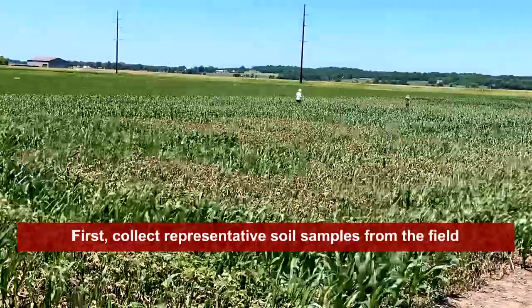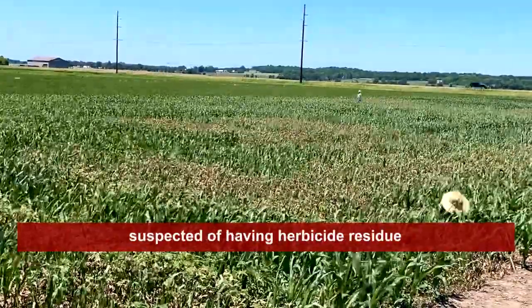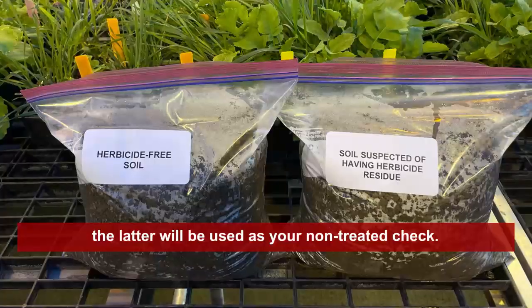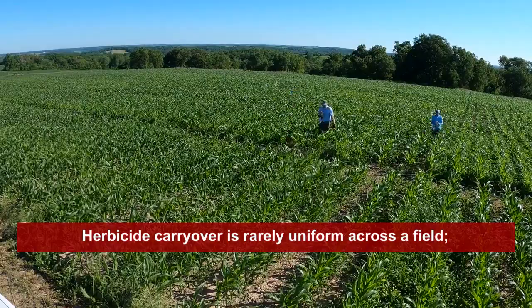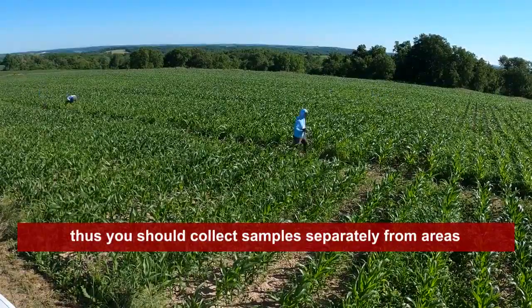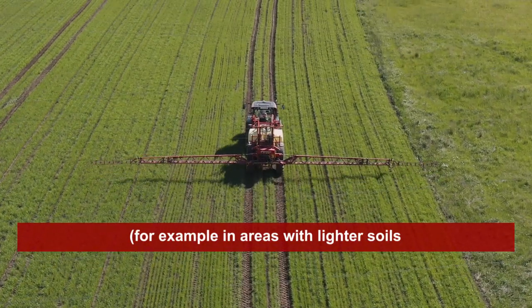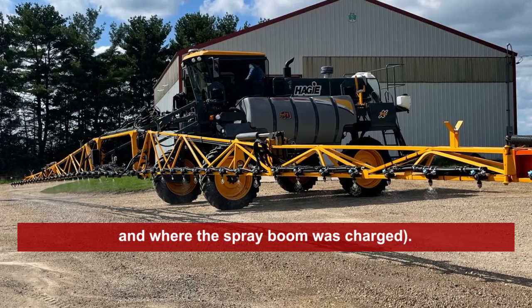First, collect representative soil samples from the field suspected of having herbicide residue and from areas known to be free of herbicides. The latter will be used as your non-treated check. Herbicide carryover is rarely uniform across a field. Thus, you should collect samples separately from areas where more herbicide residue is expected, for example, in areas with lighter soils and where the spray boom was charged.